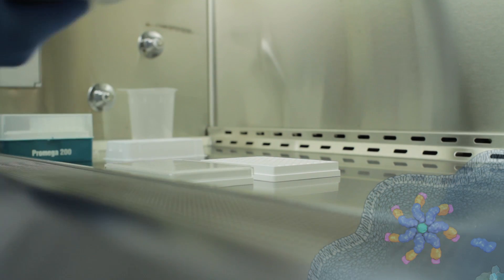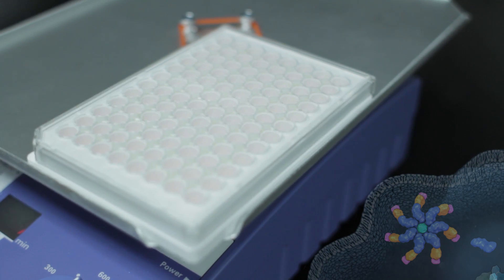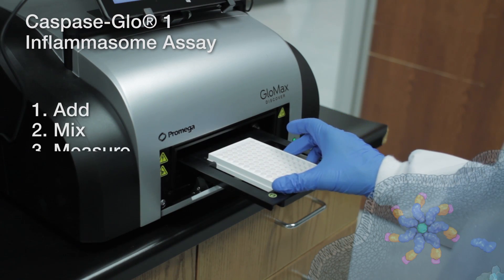The protocol is easy and straightforward, involving only three steps: add, mix, and measure.